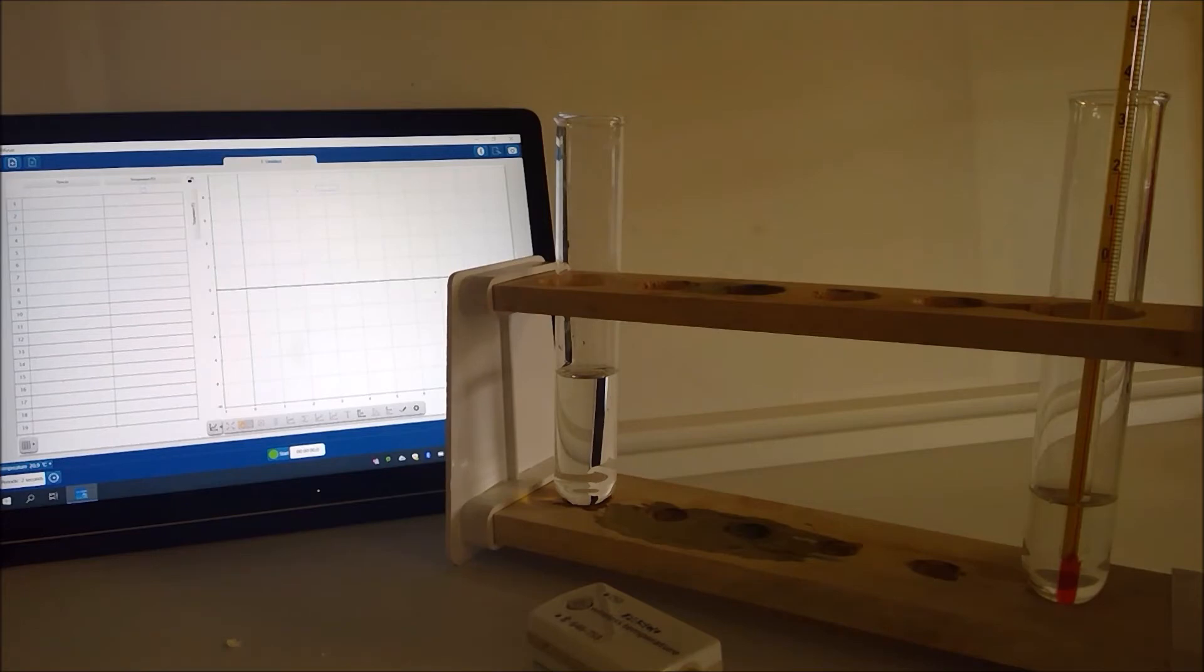You might like to look at the mixture as well and see if you can notice any visible change occurring during the reaction.